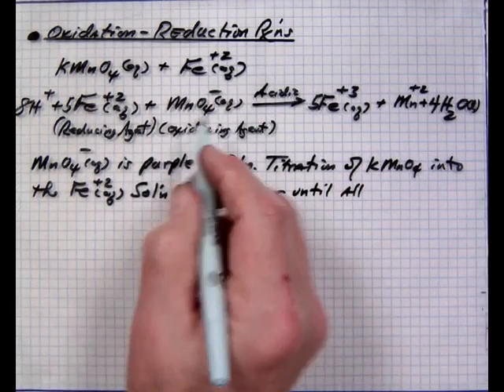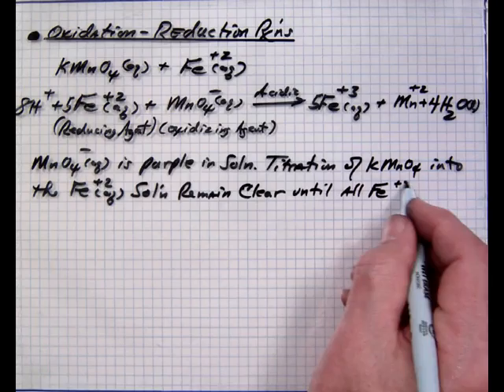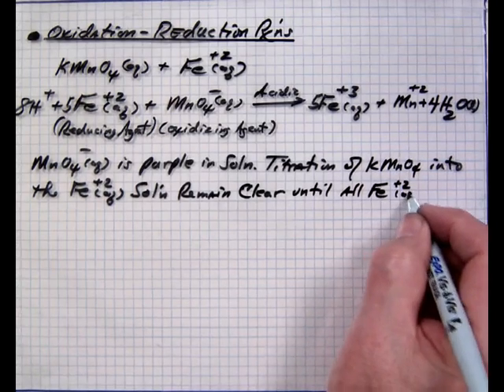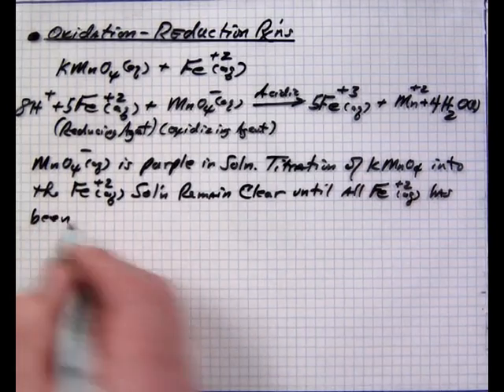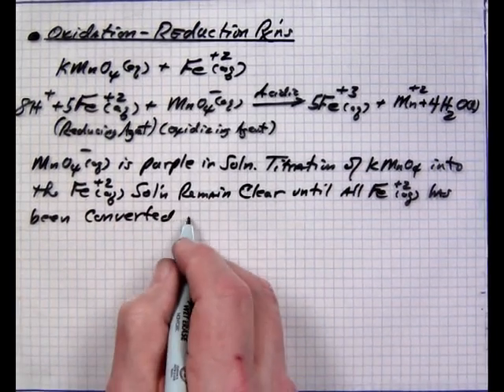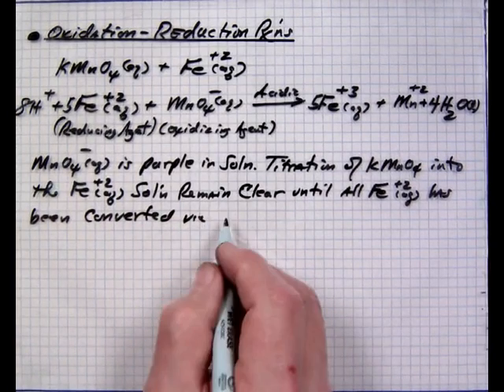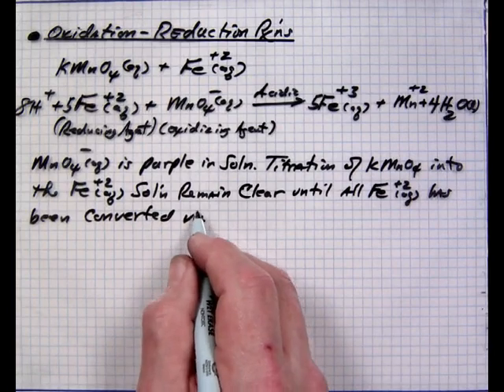all of the iron 2 aqueous has been converted via oxidation, excuse me.